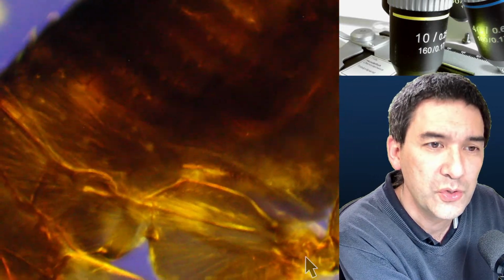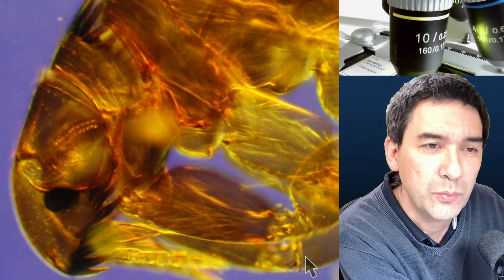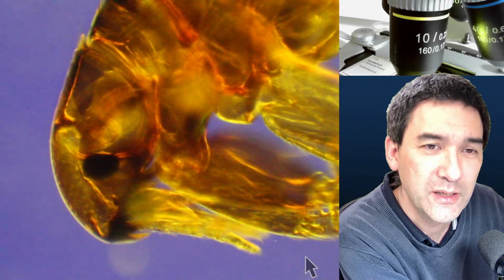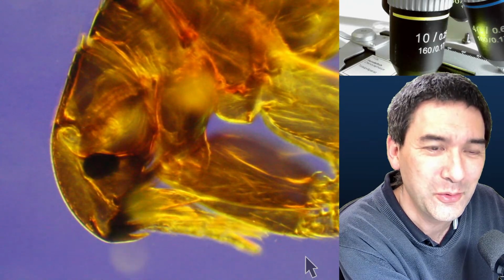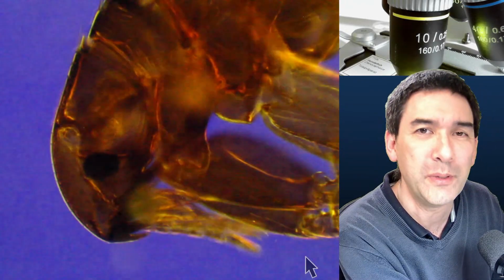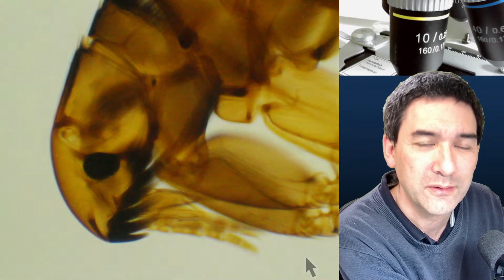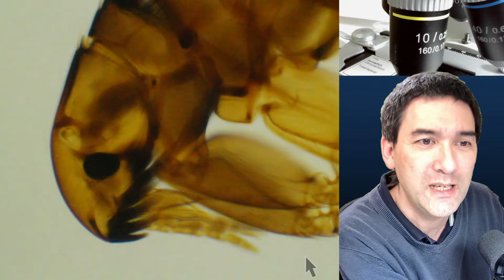And then, of course, we're able to see certain structures in a way that we normally would not be able to see them. It does look a little bit similar to my DIC contrasting technique. In comparison, how does this look in regular bright field? This is how it looks in regular bright field. I have not changed any condenser settings.